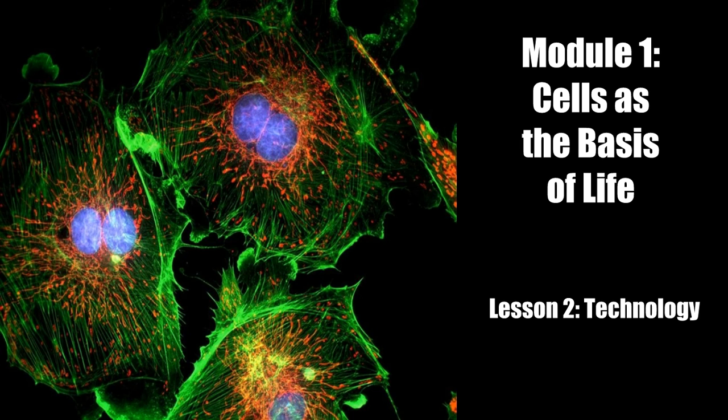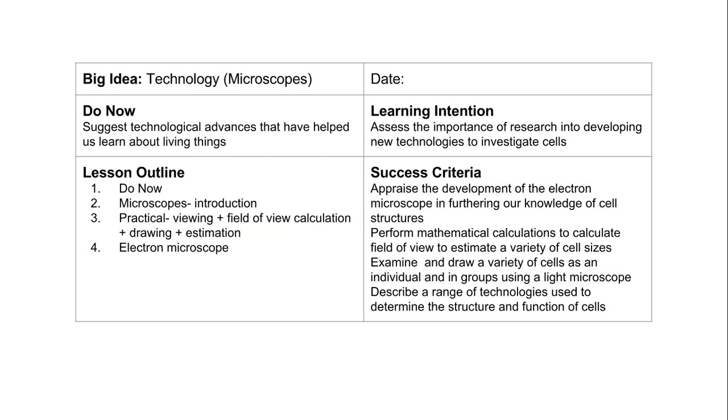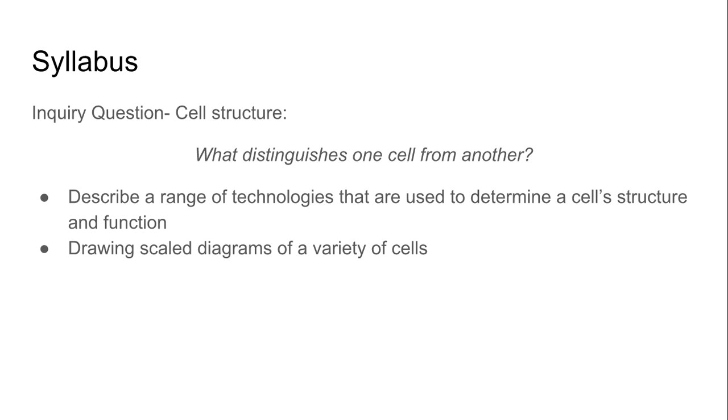Welcome to lesson 2 of module 1, Cells as the Basis of Life. In this video, we're going to be looking at technology and mainly microscopes, how they've progressed over time, but also some of the numeracy skills that are required for using a microscope in biology.